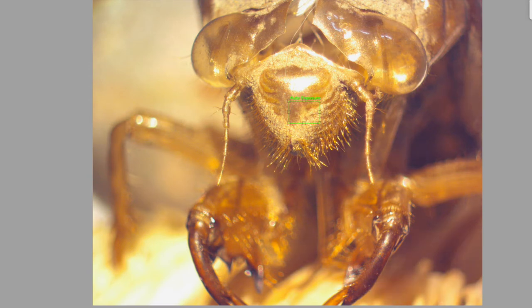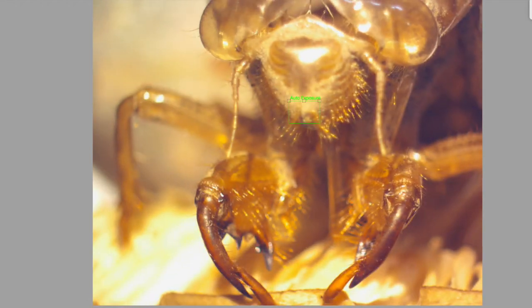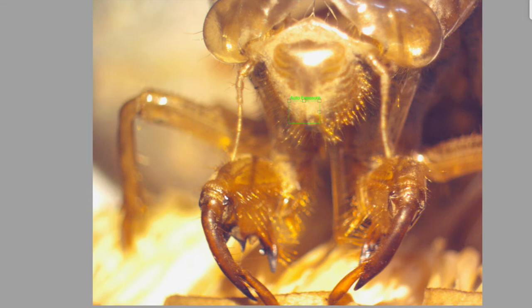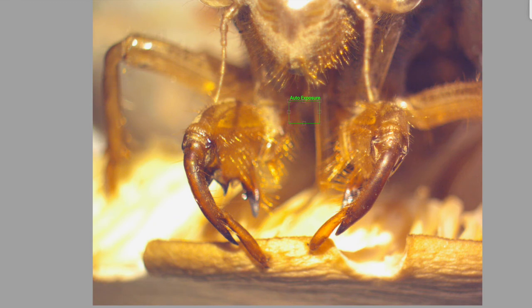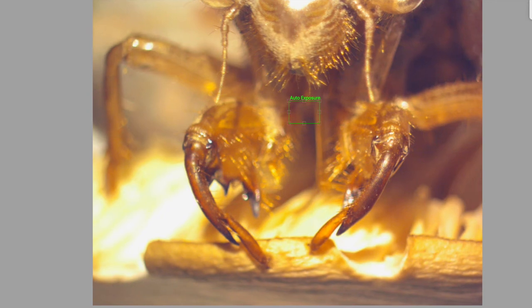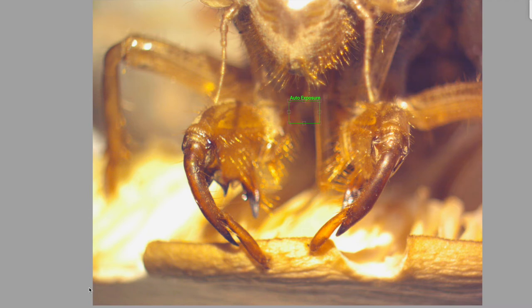Got the whiskers. Actually, he's kind of goofy looking. Check out these claws. Sorry, my paper in the back is kind of getting in the way. Look at those things. It looks like if you look right here, that's the end of the claw, but I wonder if this is something else. Like there's little pinchers down here. That is crazy cool.